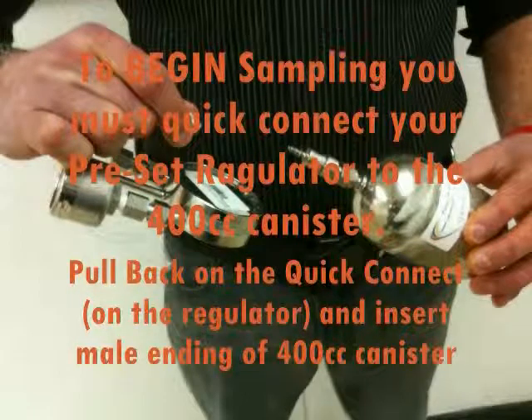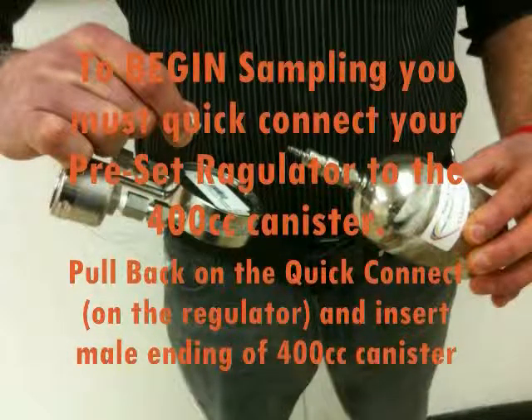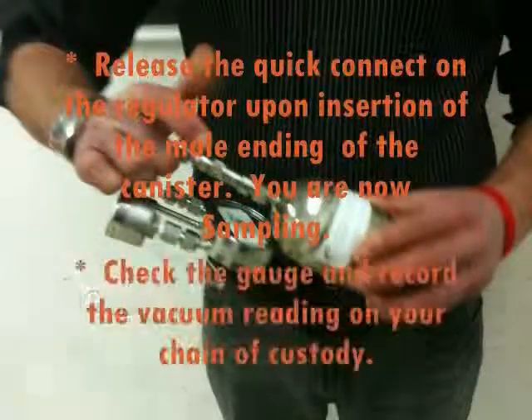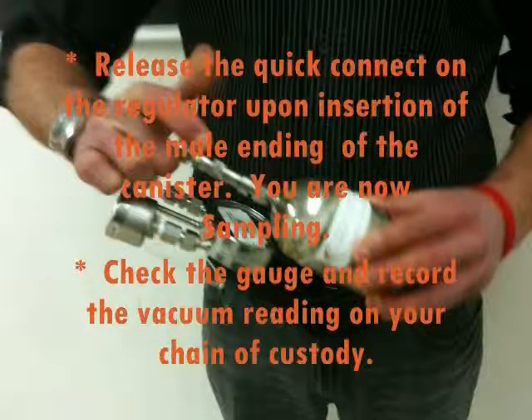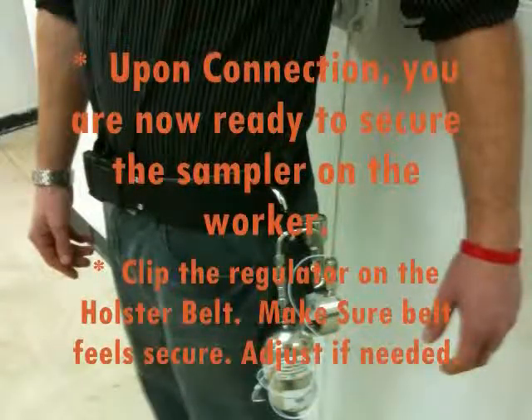To begin sampling, you must quick connect the preset regulator and canister by pulling back the locking mechanism on the regulator and inserting the male ending of the mini-can. Once flush, release the lock. You are now connected. Once connected, the canister is now drawing sample. Please check the connection and record the gauge reading on the chain of custody.